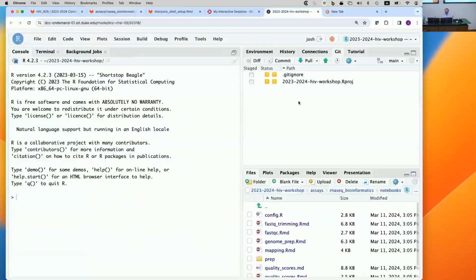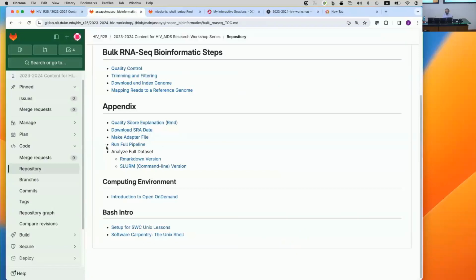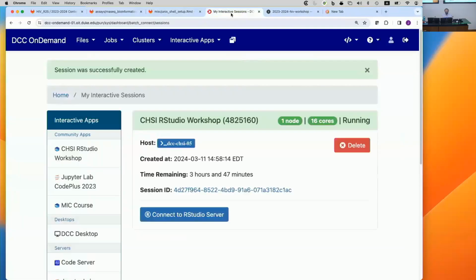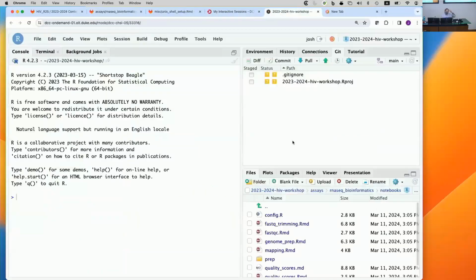We're going to work through an example with just one FASTQ file. There are also scripts for running the whole thing on all the data, and I've done that so those files are available for next week when you're doing the downstream analysis. Today we're just going to walk through one file to give you a taste of it.